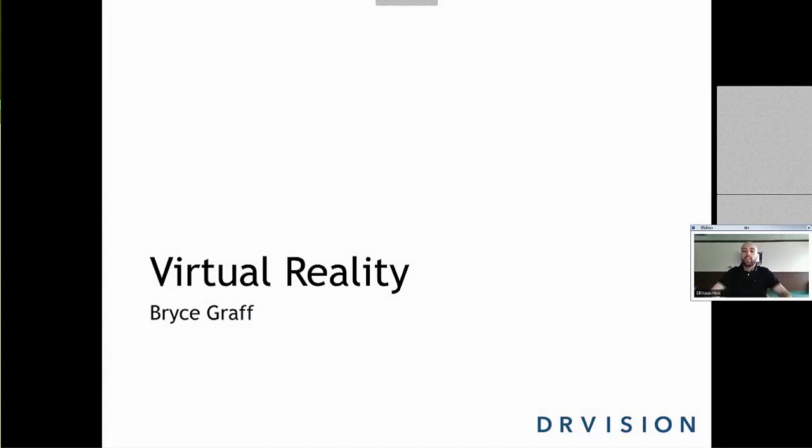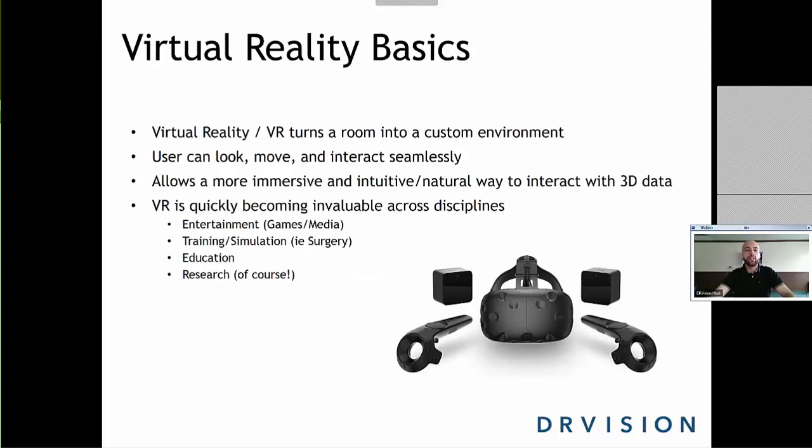Hi, I'm Bryce Graff. I'm a software engineer at DRVision, and we're just going to give a quick primer on virtual reality. Everybody has a different experience level. So virtual reality basics: it turns a room into a custom environment, and the idea is that the user can move and interact seamlessly. It creates a really intuitive environment, and it's one of the most natural ways to interact with 3D data.